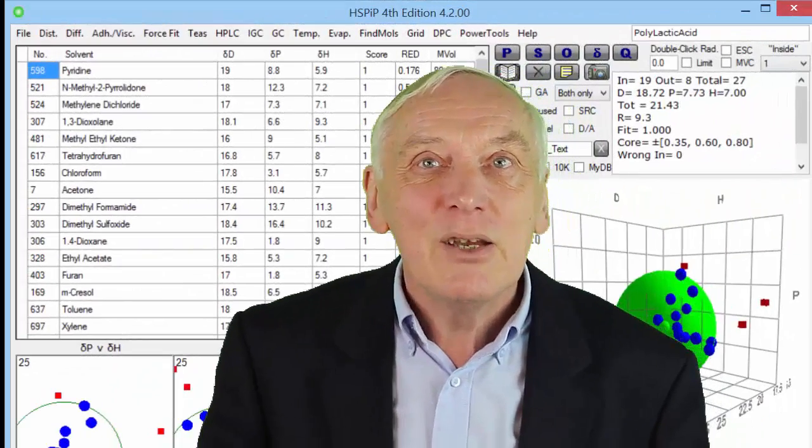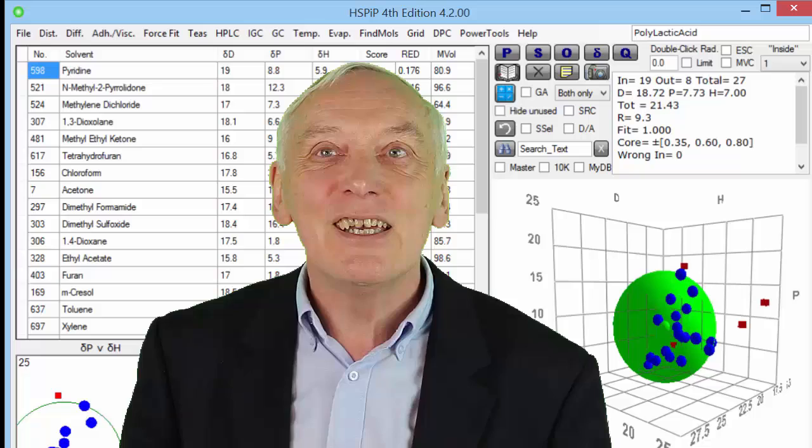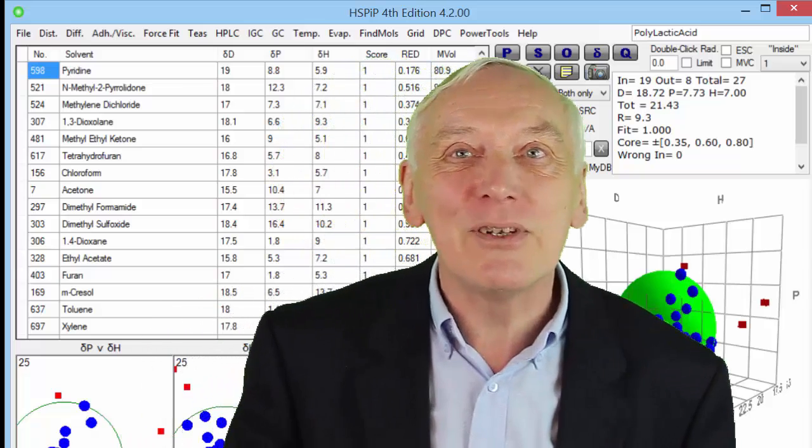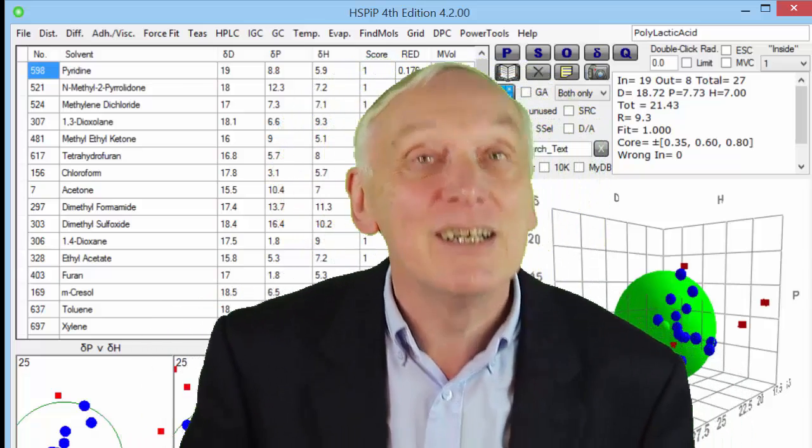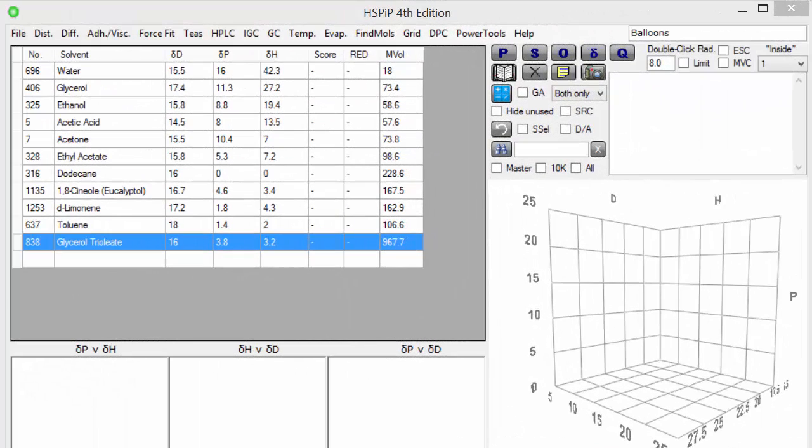In this clip we use a deliberately amusing technique for measuring the Hansen solubility parameters of polyisoprene rubber, also known as balloons. Even the best live science demo can go wrong in many ways and as you will see in a moment my demo definitely had some issues, but it was good fun doing it and it makes a serious point. So let's watch my live determination of the HSP of polyisoprene and then we'll discuss the results when we finish the video.